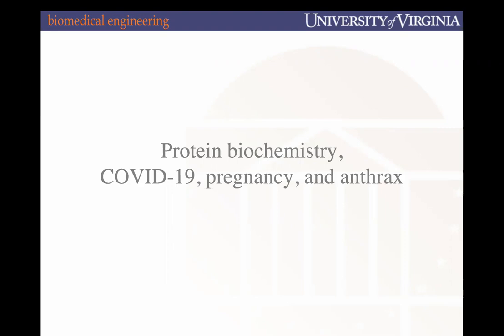So up to this point, we first started discussing what proteins are made out of. We've talked about different classes of proteins, enzymes and G proteins, and where they're located within the cell. But for today's lecture, we're not going to be focusing on a specific disease, but rather on how we measure and analyze these different proteins.